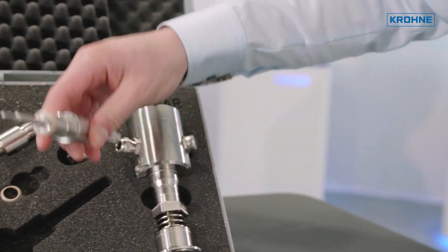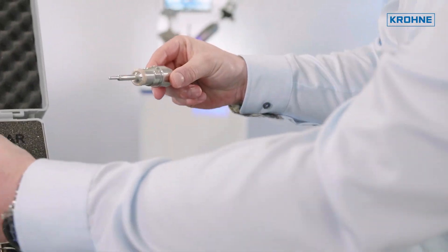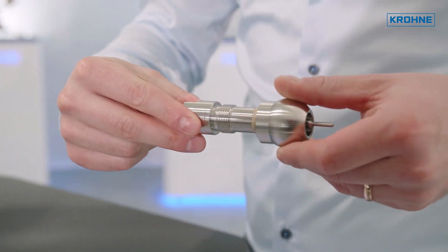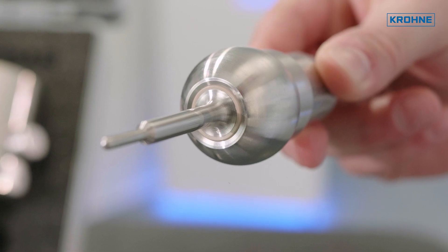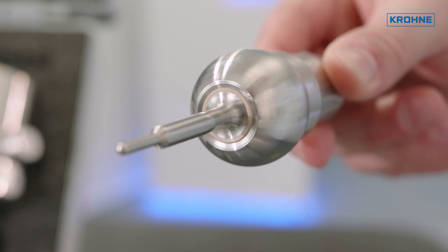This is great. Does this work with this weld-in adapter? Yes, exactly. All sensors with G 1.5-inch process connection are compatible with our EH certified adapters. So you can use the whole variety of adapters for your process connection.